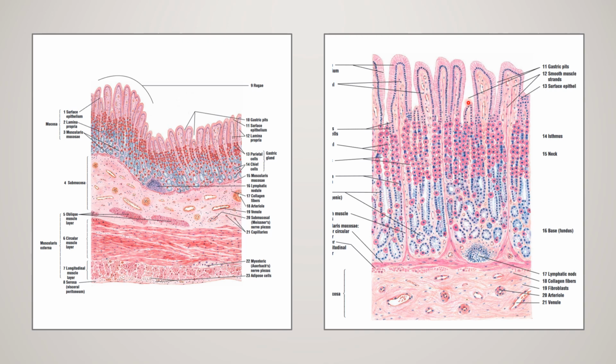Already I told what it is: the site of dipping of the epithelium into the lamina propria is called the gastric pit. Beyond that, we have the gastric gland or fundic gland. There mainly we have three types of cells: mucous neck cells secreting mucus. Next, your parietal cells or oxyntic cells secrete your hydrochloric acid as well as intrinsic factor.